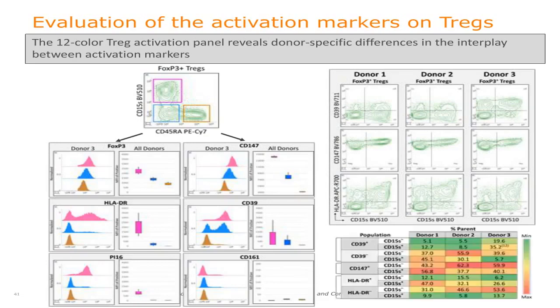And we can plot this based off of the relative percentage of cells that are in the various quadrants using our conventional analysis approaches. And you can also see that, in this situation, there's a unique difference for CD39, for which we have a reference here for a paper that actually discusses some of those variabilities for CD39 expression that you see within donors.